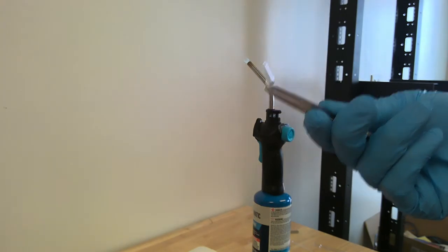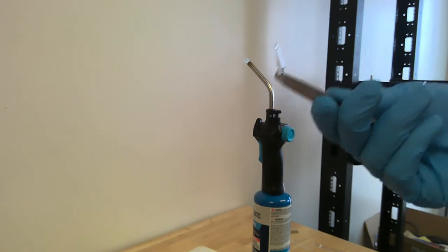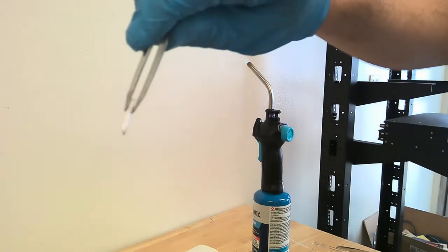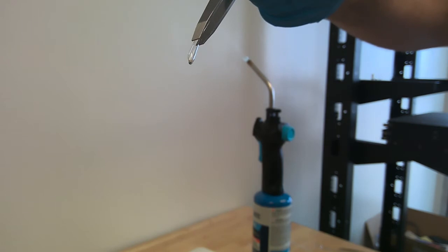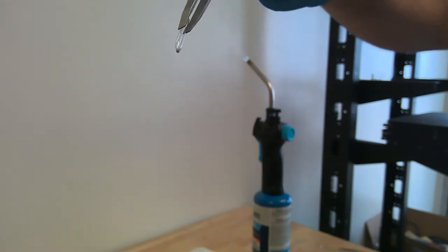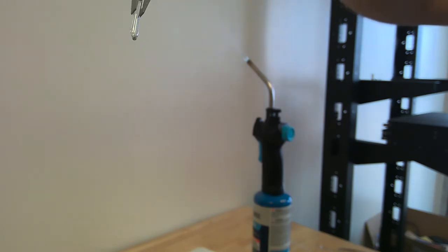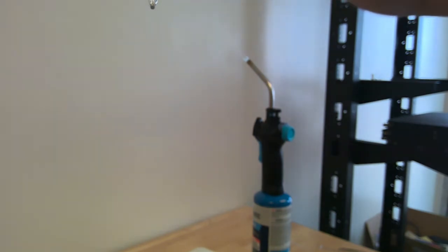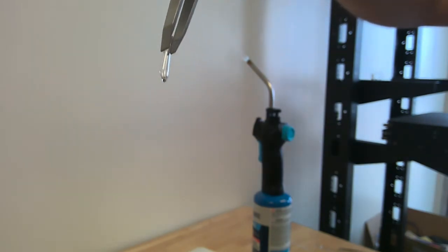We're going to allow this picnometer to cool, and then we're going to trim the ends and smooth them out to get a complete microscale picnometer. So here's a completed picnometer that I pulled in a separate trial. Notice how it's quite small. It's mainly designed to hold around 50 to 200 microliters of liquid. The bottom end is completely sealed, and the top end has been flame polished. So this is what the completed picnometer will look like. We'll continue working on the picnometer that we've prepared, and we'll showcase the final product later on in this recording.